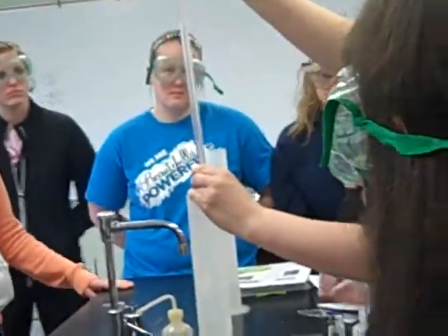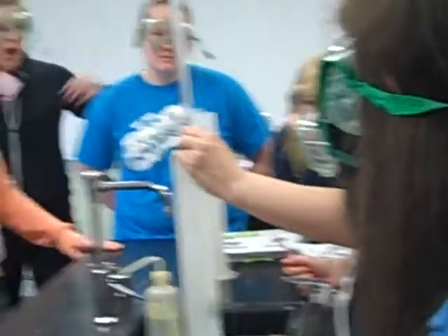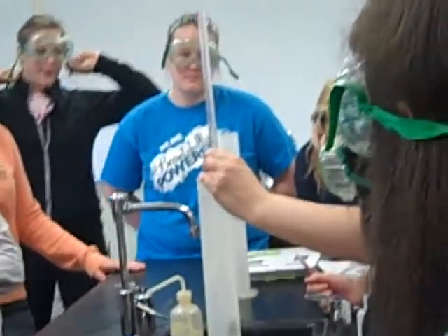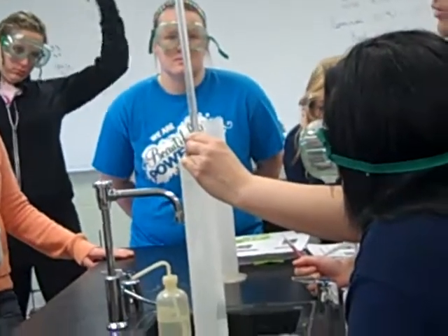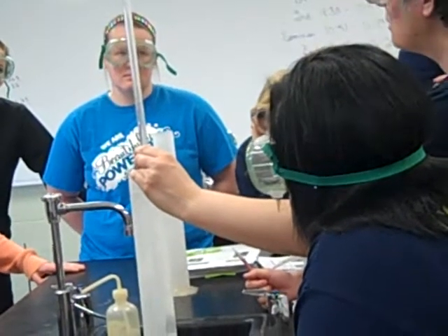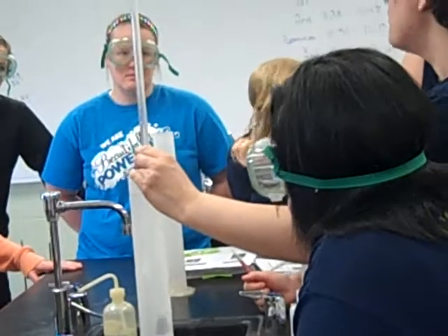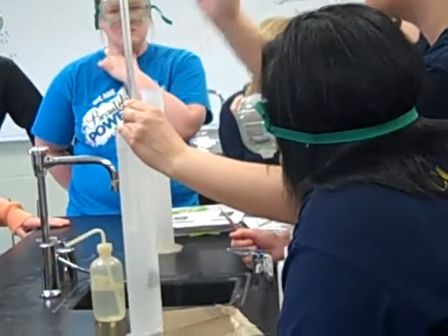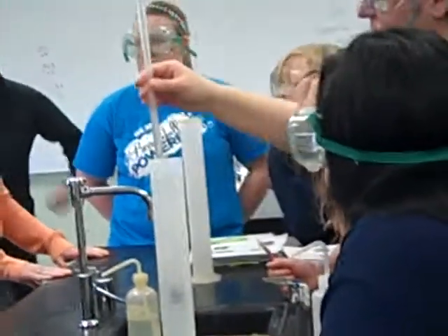One thing to keep in mind is that these go down — so here's one, two, three, four, five — you're reading it a little bit backwards, so pay attention to where those numbers are. It is marked in tenths of a milliliter. So what are we going to measure it in? We'll estimate to the hundredths. You should have a measurement to the hundredth of a milliliter.